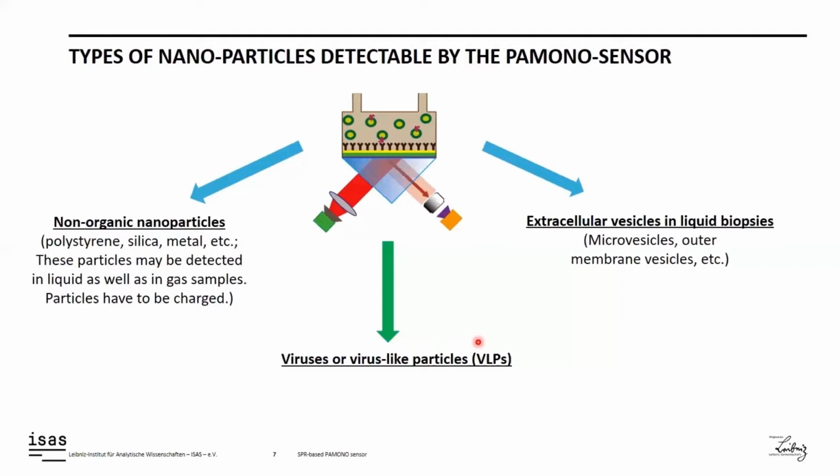And that's great, because they can serve as a very nice model for our studies. We may work with virus-like particles which possess a surface equal to dangerous viruses, but are not dangerous.